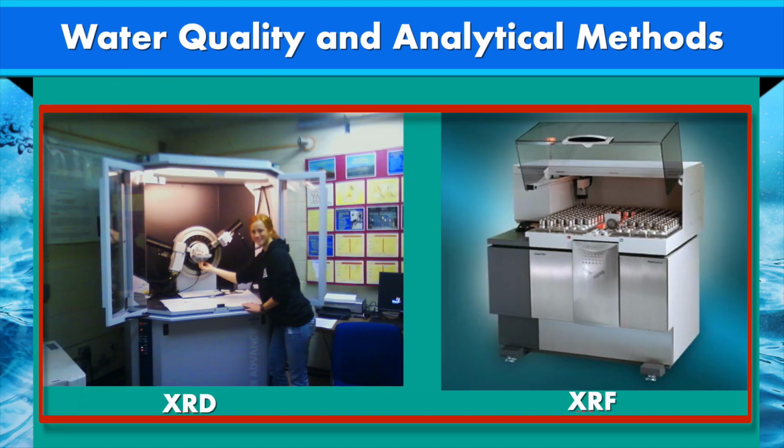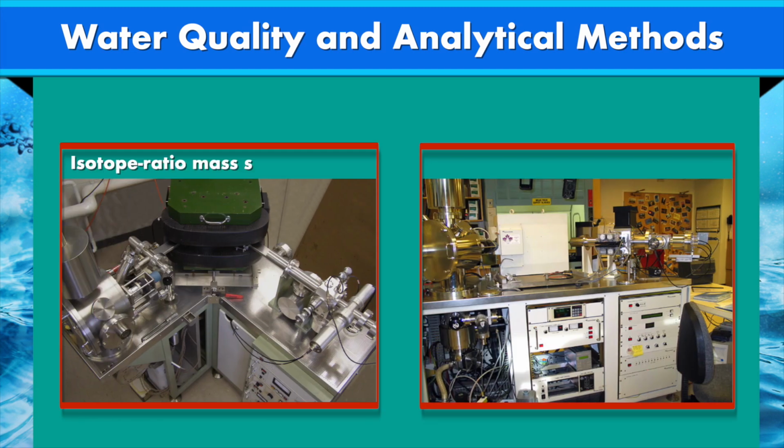Labs required to measure sediment samples for major oxides and trace components may have X-ray fluorescence instruments. At the same time, X-ray powder diffraction equipment is useful in characterizing the sample for the presence of minerals. A lab may also be equipped with isotope ratio mass spectrometry for measuring stable isotopes and HR ICP-MS for radiogenic isotopes. These instruments are costly, but they are a reliable solution to generate high quality analytical data.